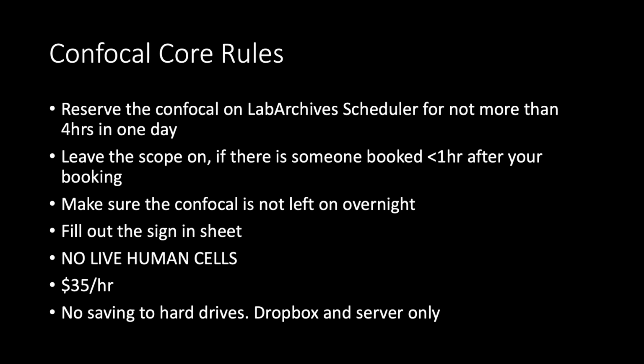We do our scheduling and the bookings through lab archives, and you will receive an invite after your second training to either be granted permission for the confocal or to be invited to lab archives. If you are the last user of the day, make sure the confocal is not left on overnight, meaning that if there's someone that is on the confocal after you, you should confirm with them that they will be attending their appointment. If you need to cancel your reservation, try to do so as far in advance as possible so that either other people can book or that nobody leaves the microscope on for you.